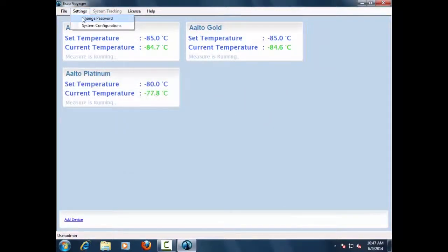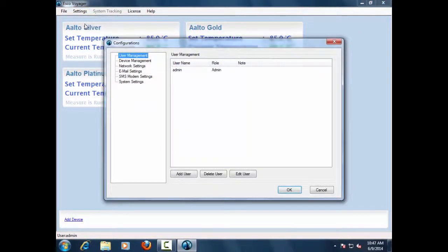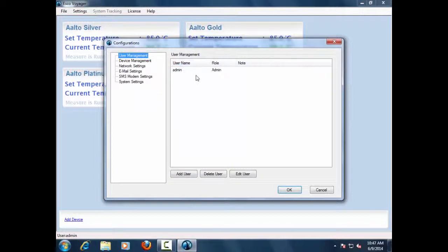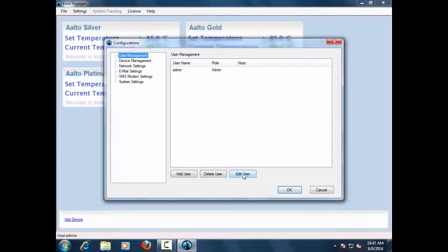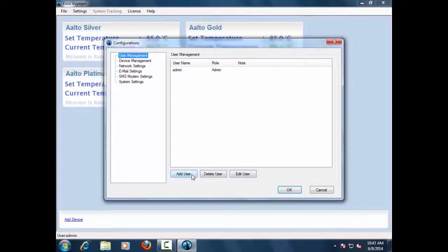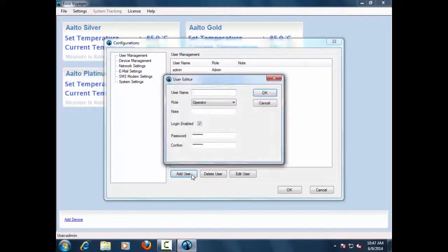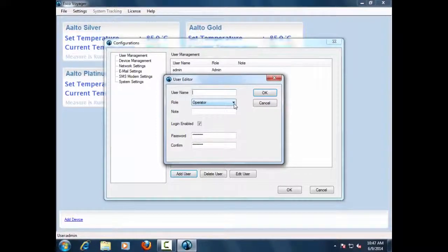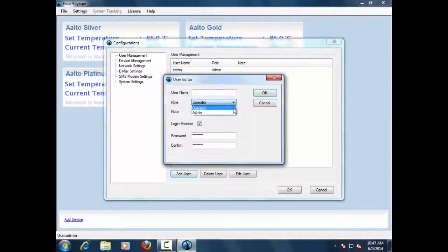A number of configuration options are available for the user to customize the Voyager as per requirements. This configuration block shows the list of users that have access to the Voyager software. The users can have one of two levels of access: either operator or admin.